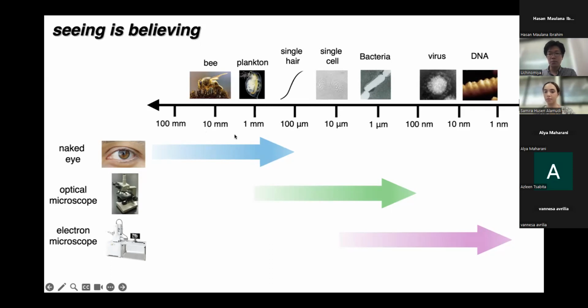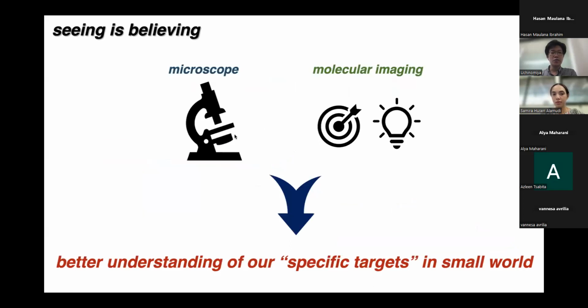Microscopes can provide detailed information on the shape and structure of samples. And I also explained how important it is to selectively detect our target in crude conditions. Because a microscope can only observe shape and structure, it is difficult to selectively detect our target in crude conditions.